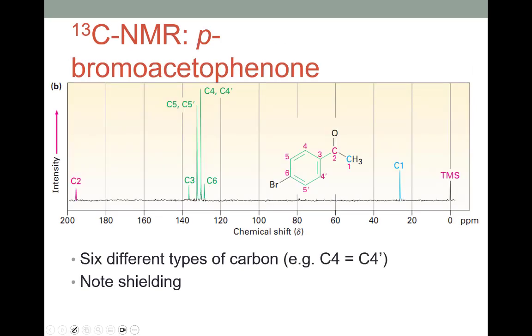If we look at another example, so again, here's a molecule. Everything's color-coded for us. If we didn't have the structure and we saw this C1 blue peak showing up here, we'd say that's in the neighborhood of a normal alkane, but it's shifted up a bit. So I'd expect it to be close to some electronegative center. In this case, we see it's a ketone. Likewise, I would see the signal from the pink carbon way over here, and I would expect that it is the carbon of the electronegative center, so in this case, the carbon of the ketone group.